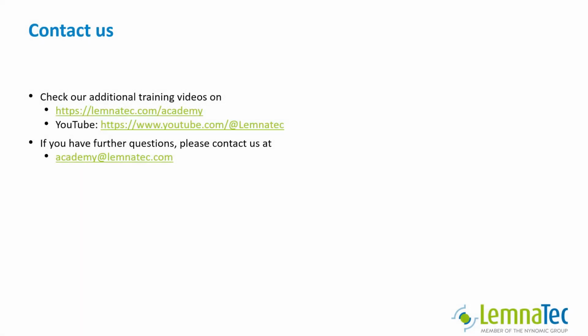In this video, we learned how to add sample annotations to your data in LemnaExperiment to cover additional external information on your samples and cohorts.